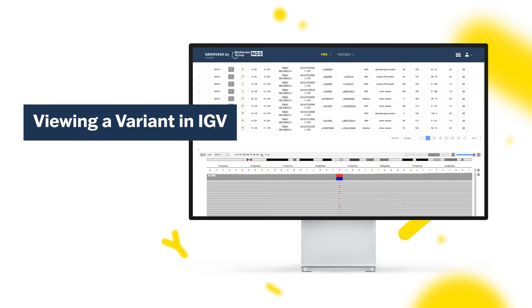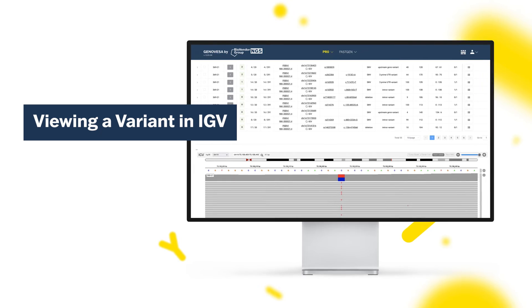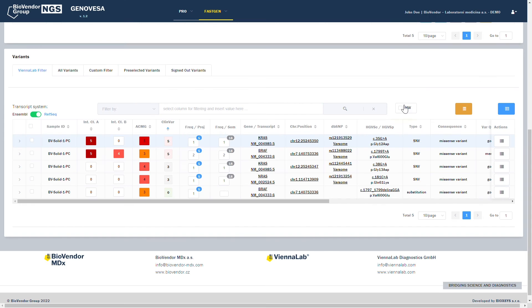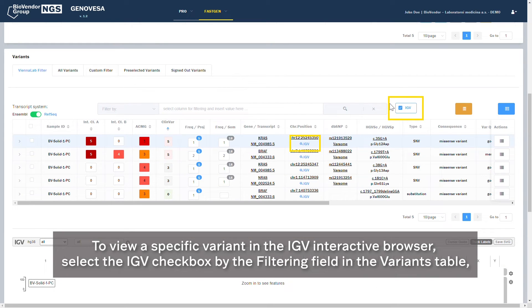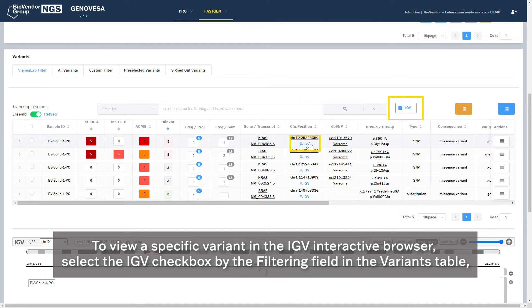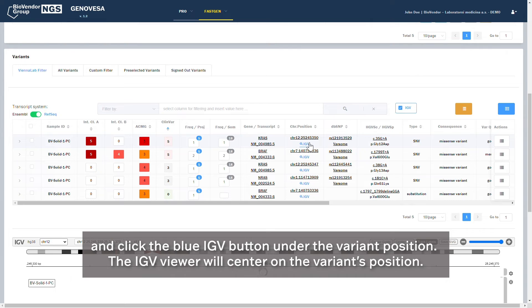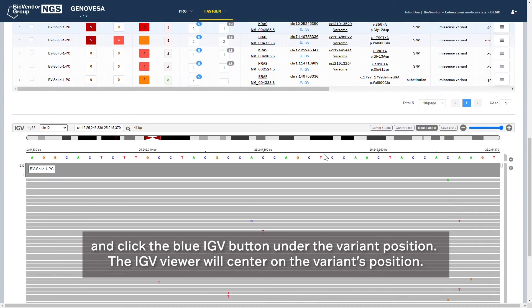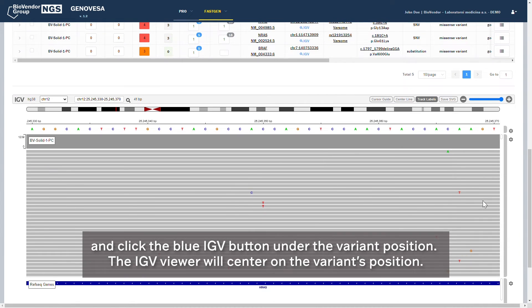Viewing a Variant in IGV. To view a specific variant in the IGV interactive browser, select the IGV checkbox by the filtering field in the Variants table and click the blue IGV button under the variant position. The IGV viewer will center on the variant's position.